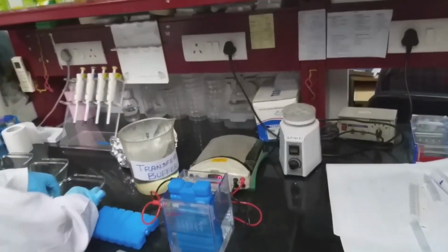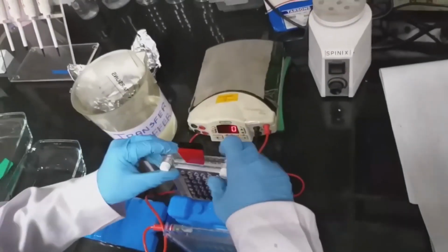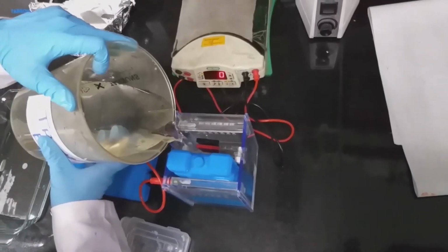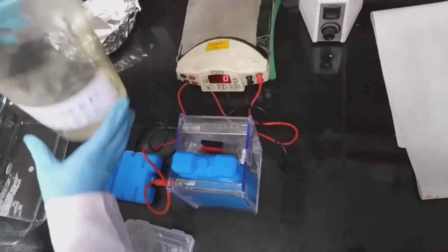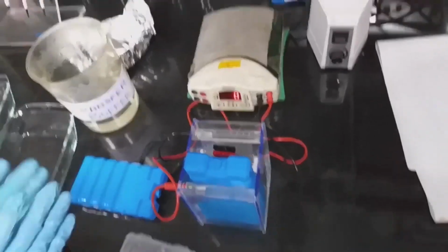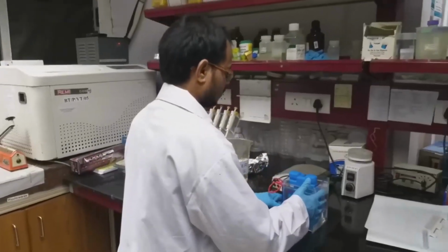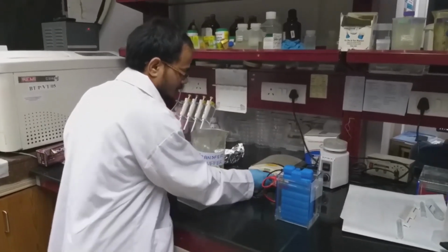Once that is over, you directly take out the cassette. If there is buffer insufficiency, you can add more on top. Make sure the cassette is completely submerged so that the transfer will be proper and there are no air bubbles. Once the setup is over, now you can transfer.